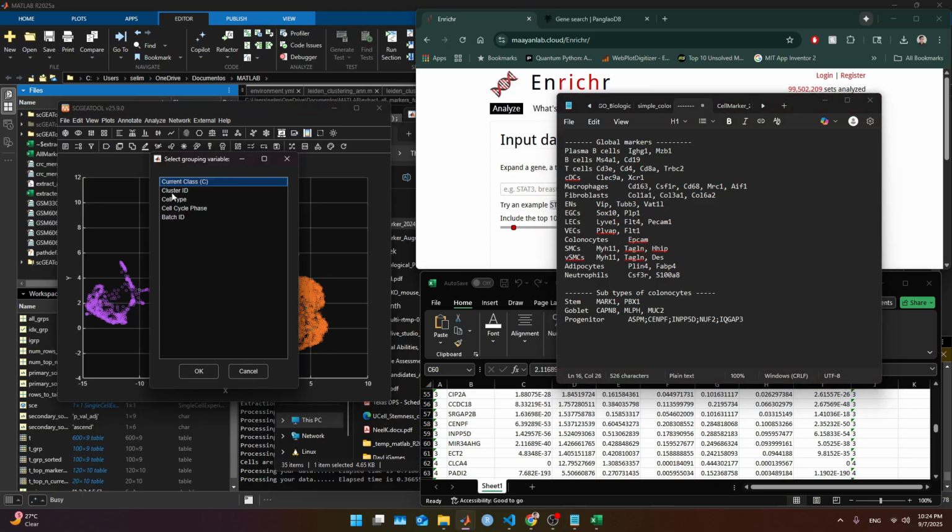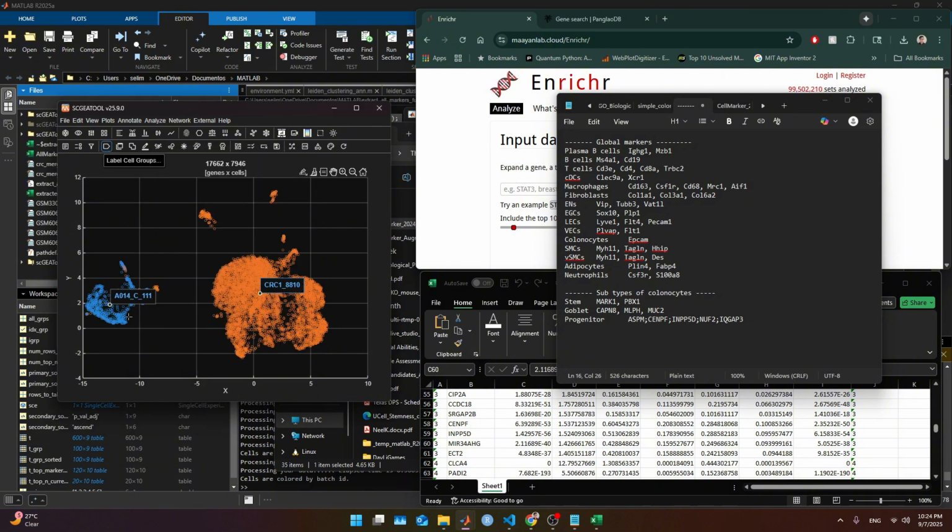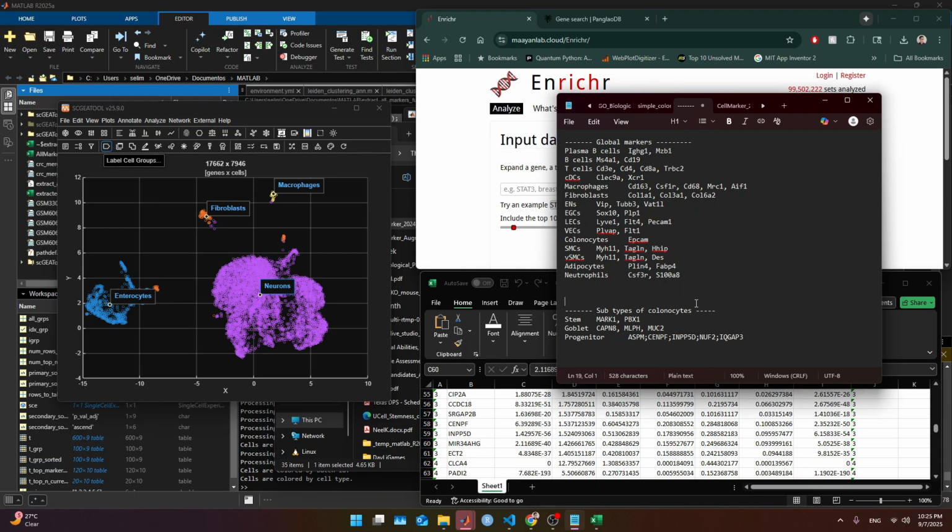How I know this is because if we go to the batch, all the cancer are here, and here are just the healthy. So some colonocytes should be here. And as I remember, this blue one was classified as enterocyte before. Let's look at it. Yeah, as enterocyte. So these are healthy enterocytes, and here the neurons are cancer enterocytes. Mostly what we are seeing to some extent. So all this took a lot of time for figuring out.